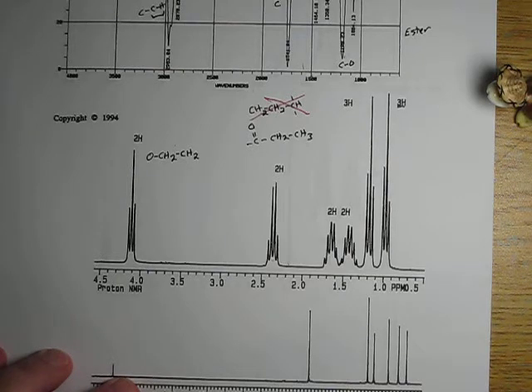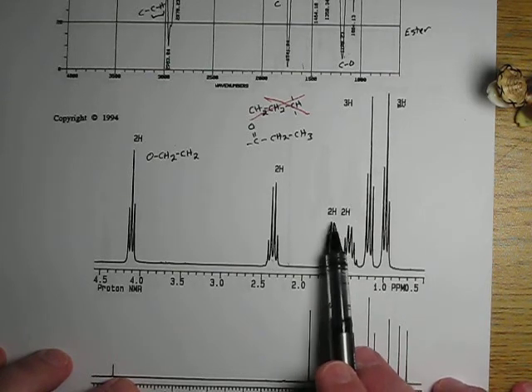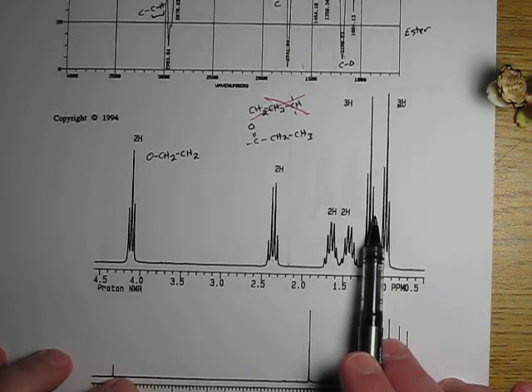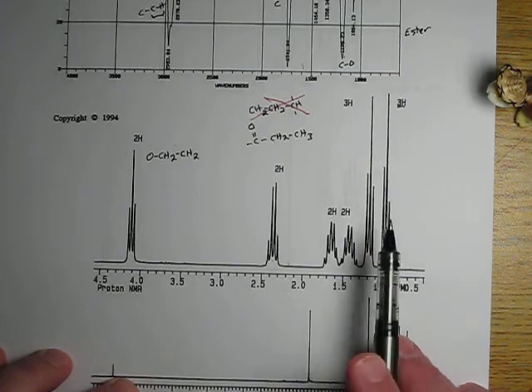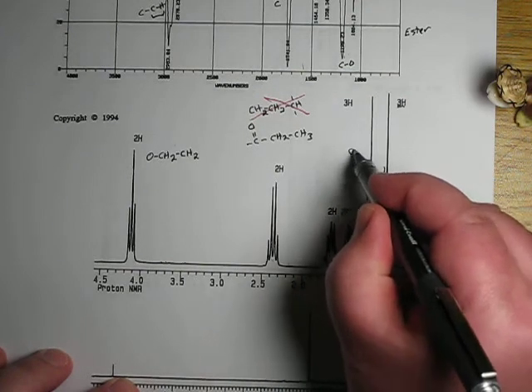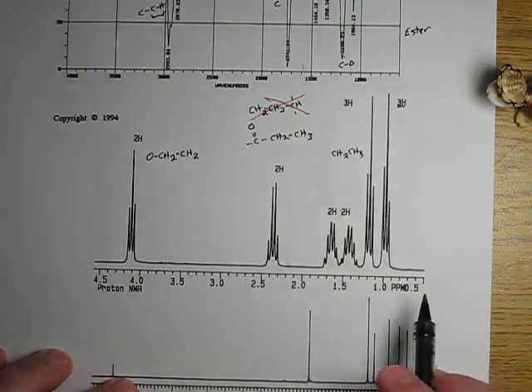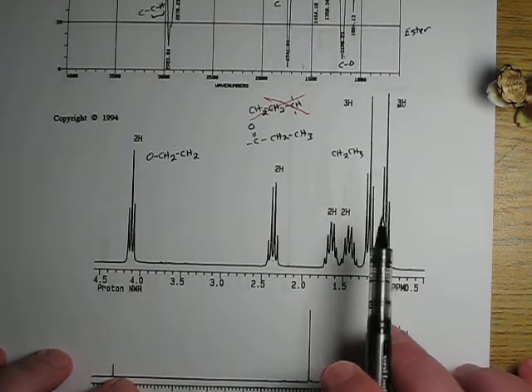Alright, well, what do we have left in here? We've got a couple of CH2s that we haven't looked at and another CH3. I'm guessing, well, CH3, yeah, this guy right there. This is a CH3, CH2. And let's look at these two guys. What are these telling us?